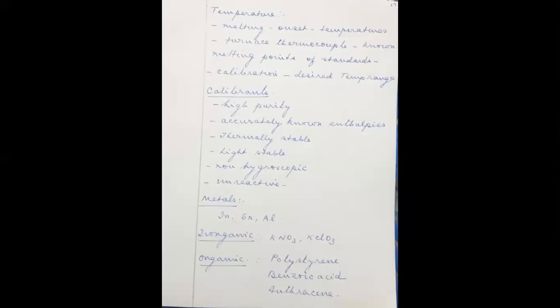First of all, it has to be experimented with substances whose melting points are well known. So the melting point of a standard substance is known and that substance is taken, kept in the differential scanning calorimeter, and then it is studied. So this is called a calibration of the instrument. In the previous class itself I told you a number of examples for calibration. Some unknown instrument is calibrated using a known instrument.